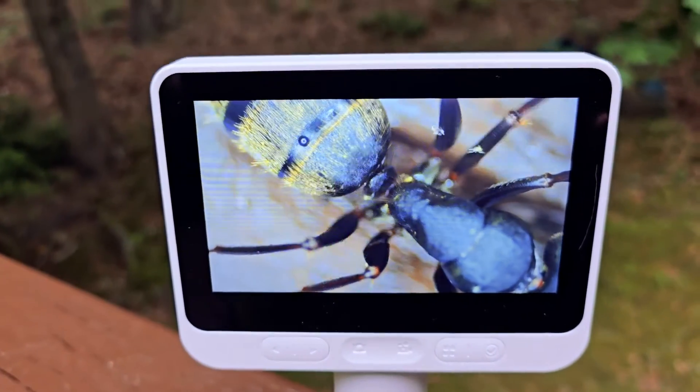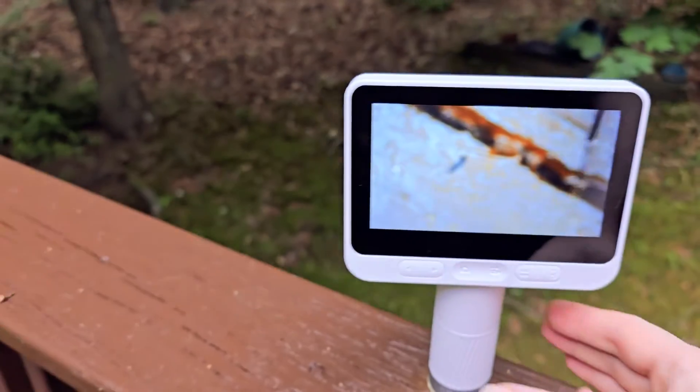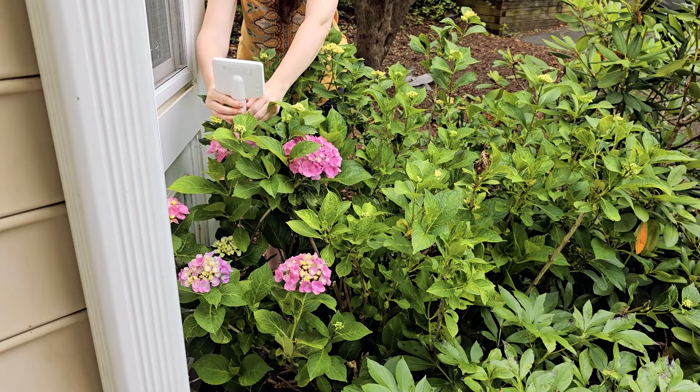Here you can see just an ant that was outside. It's crazy to be able to see the detail right there — you can see how tiny it is.